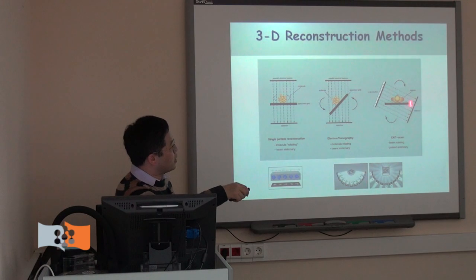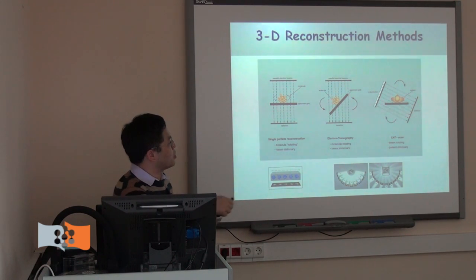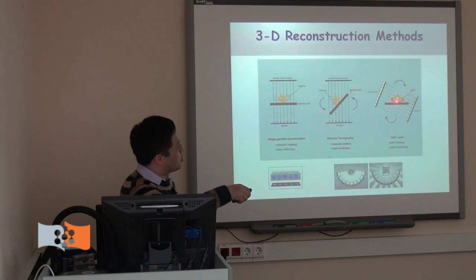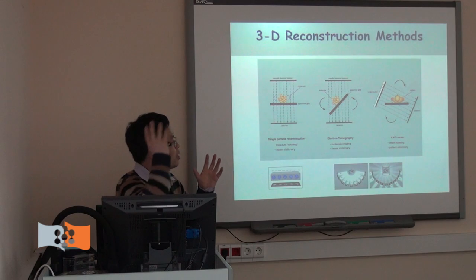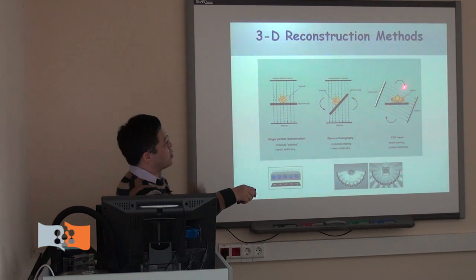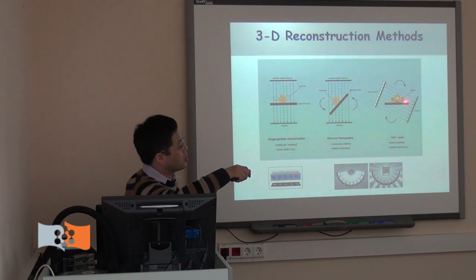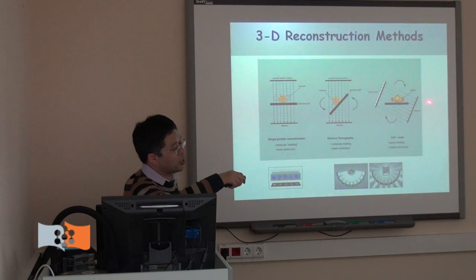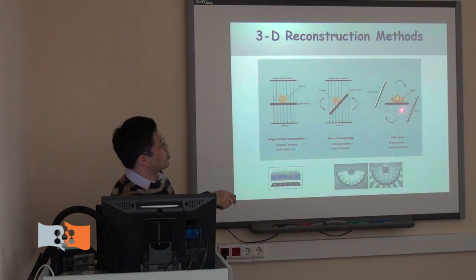So basically, the idea is like in the CAT scan in the hospital, if you want to get the 3D shape of, for example, the brain, some disease. This is a CAT scan, so the detector goes all around the object you are interested in. You get the projection image from different angles. So this is the principle of the CAT scan.